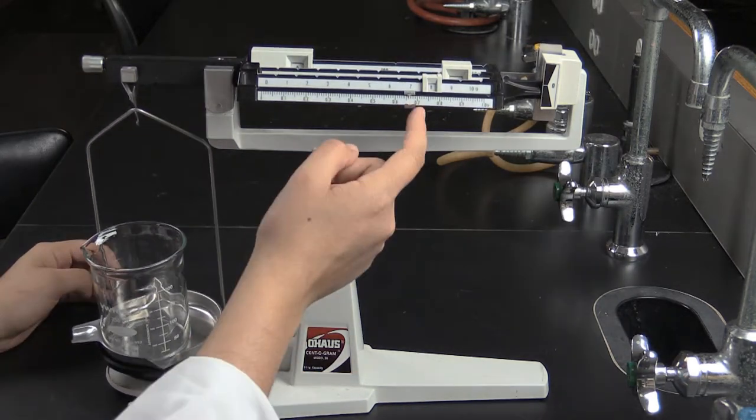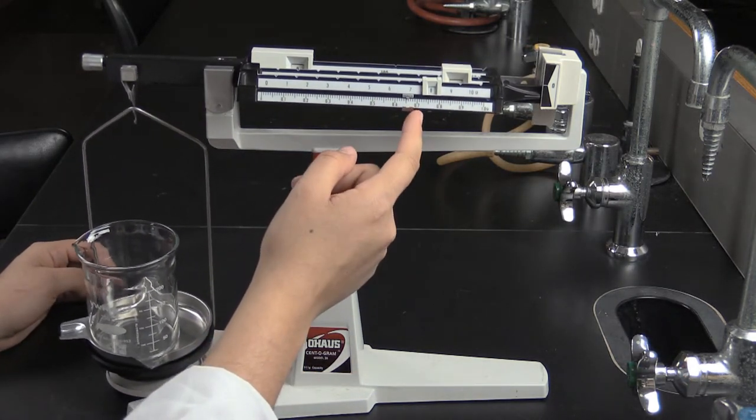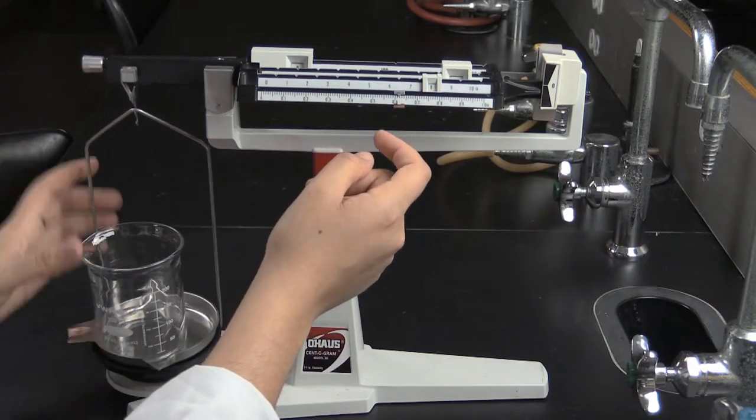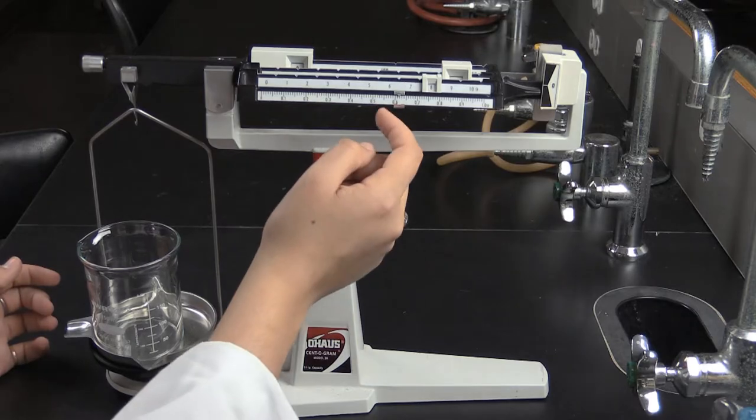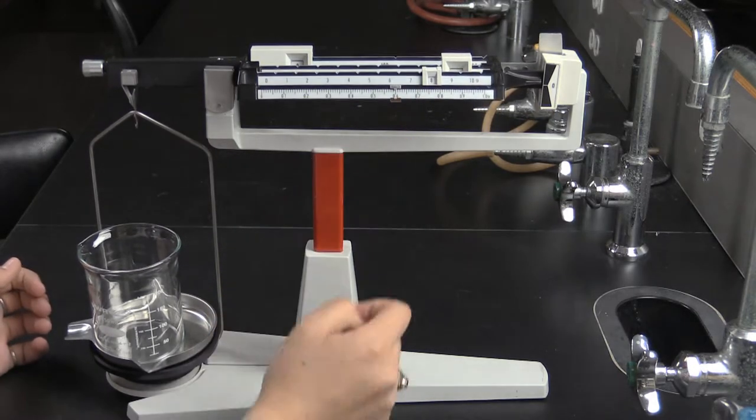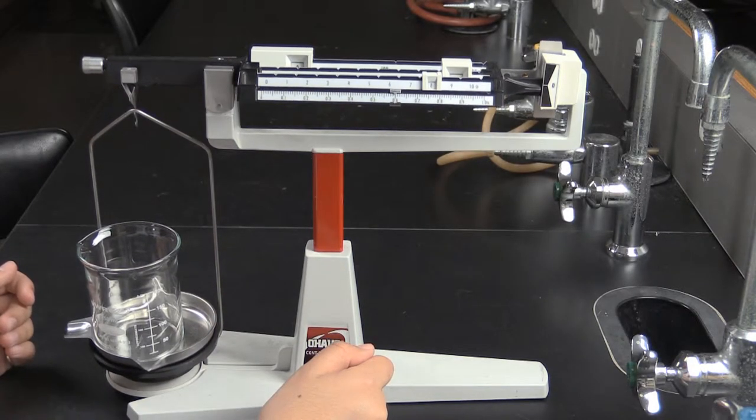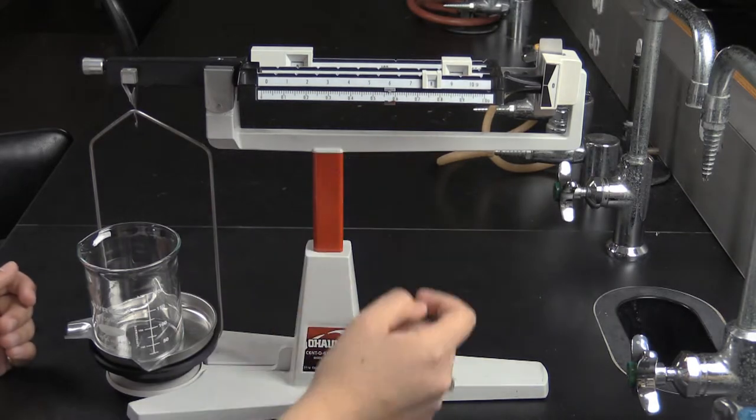Do this for each subsequent beam, being careful to make sure that the beam is still lower on the left side than on the right. For the sliders where there are notches in the beam, make sure that the slider is firmly in the notch. For a proper reading, they are not to be between notches.